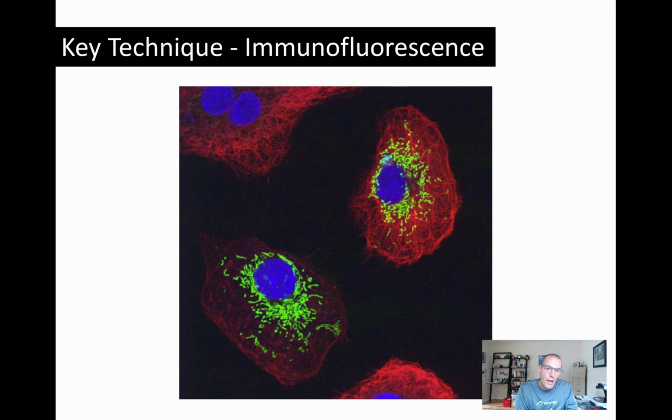And so here is what you're looking at, fluorescently labeled mitochondria in these cells, and the red is immunofluorescence, so that's staining using an anti-tubulin antibody, and so we can see the green when we take one image, and we change the filters out, and we look for the red light, and then we take an image of that, and then we can see the microtubules, and we can see the mitochondria.